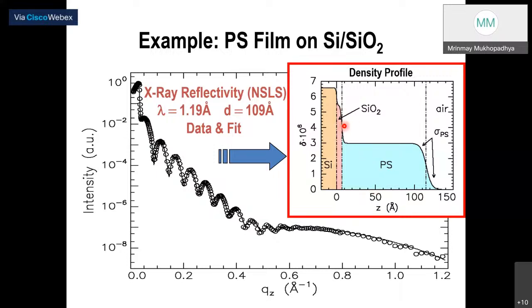And you can see that this is a little convoluted because it doesn't have a sharp interface. This convolution actually denotes the roughness. In this one the convolution is a little longer, so the roughness is more. So you can say how much roughness is in this one, and how much in this one or this one.